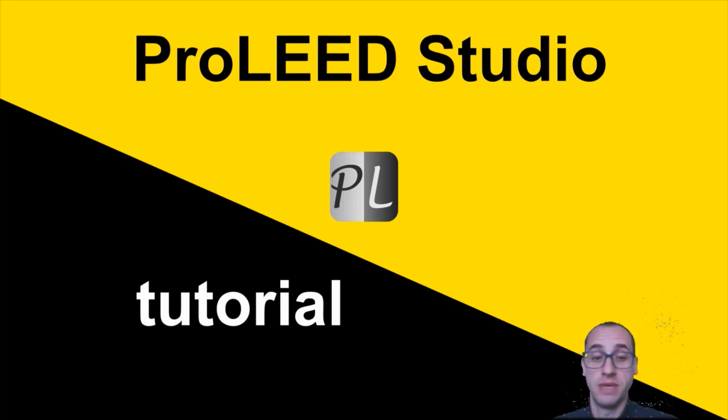As I said at the beginning, my primary goal is to make LEED pattern modeling easier, and I understand that the modeling of LEED patterns is rarely a trivial task. So if you have any ideas for additional functionality, just contact me directly and I will be happy to discuss how to implement it. So let's get started.